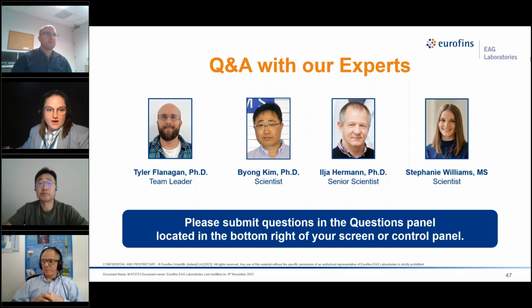Great, thank you. And Tyler, for optical profilometry, I noticed that after aligning the turret tip tilt against the sample, a single scan would show up as flat, even without the tilt plane removal. But a stitched montage would show up as tilted. Is that typical? It's interesting. I'm not entirely sure what would cause that.